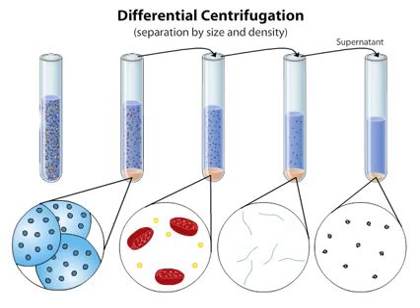The fractions obtained from differential centrifugation correspond to enriched, but still not pure, organelle preparations. For instance, some smaller particles will be found in all pellets, considering some of these particles are already present at the bottom of the tube in the original homogenate.